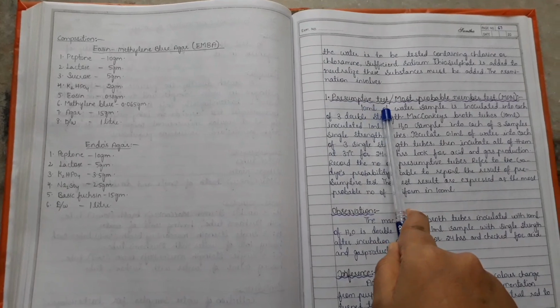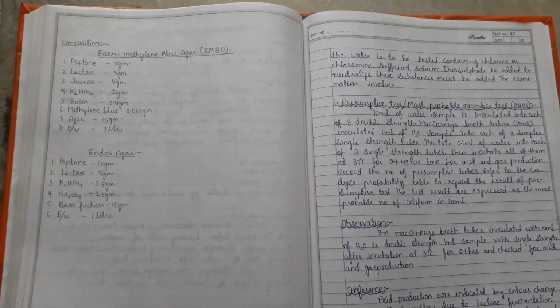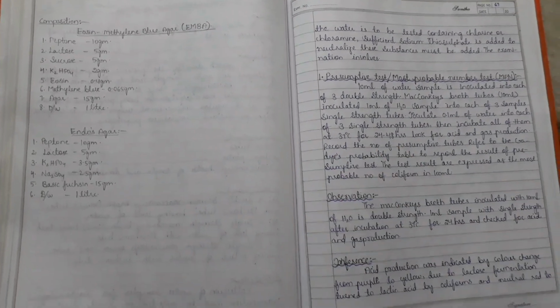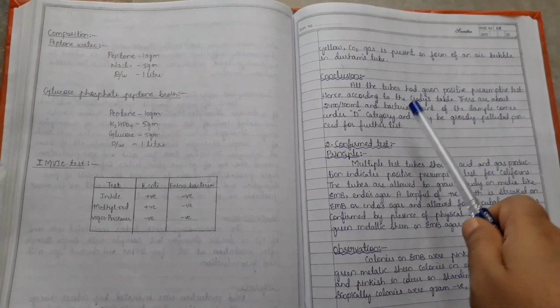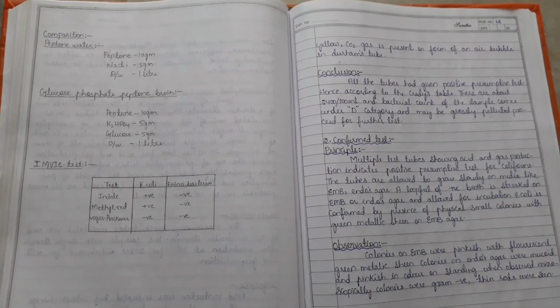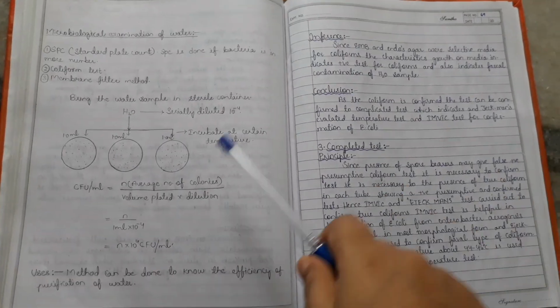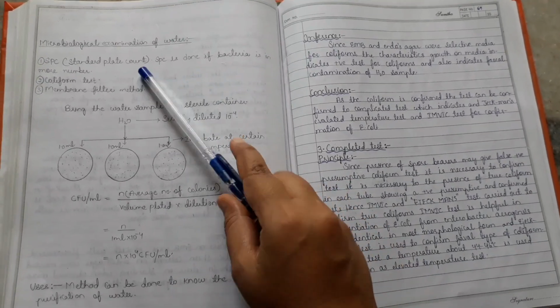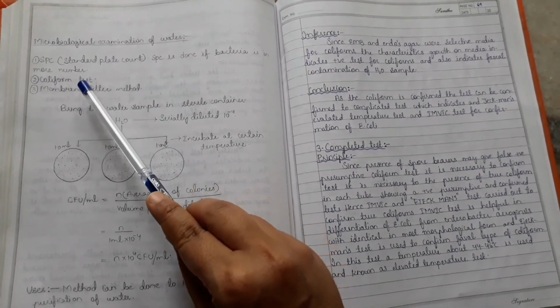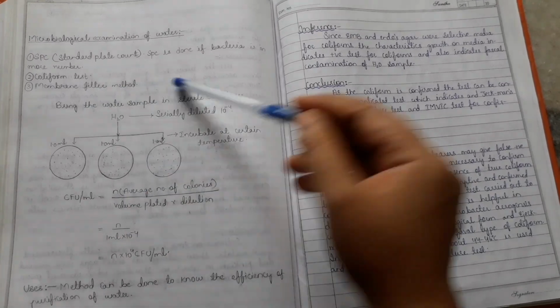So the presumptive test, or most probable number test. This is the composition for eosin methylene blue agar and endo agar. The second one is the confirmed test. Let's see in picture form the microbiological examination of water: the standard plate count, the second one is the coliform test, and the third one is the membrane filter method.